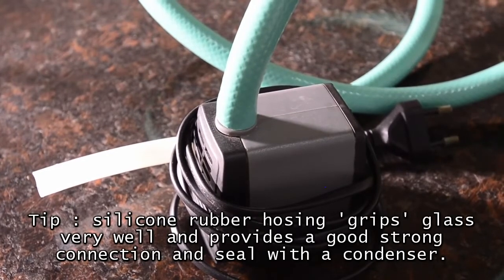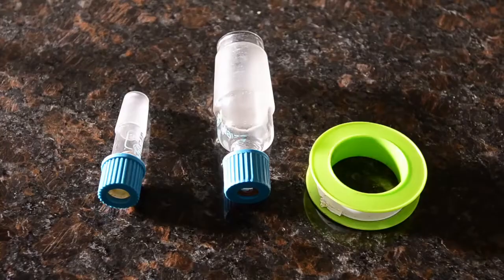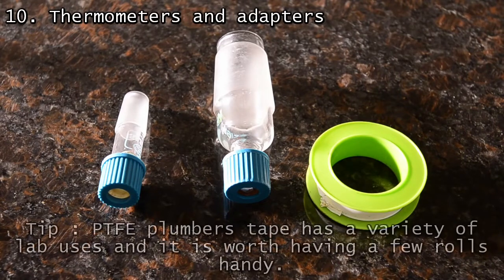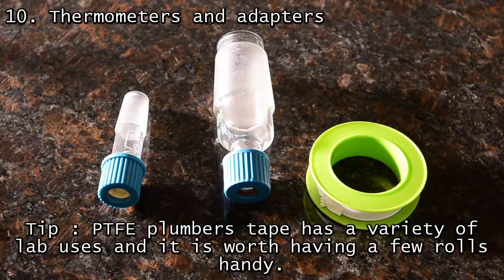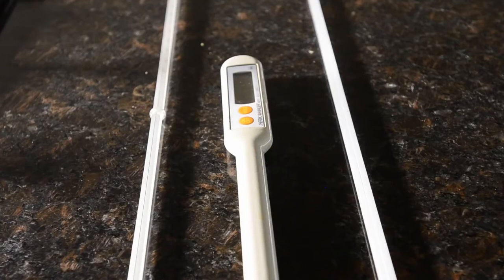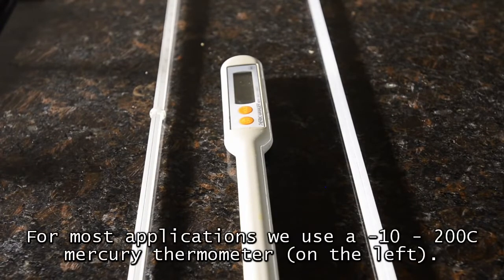Obviously, one end of one of the tubes needs to fit snugly over the water pump. To do distillation, you also need thermometer adapters so you can record the temperature of the vapors. Note that the rubber seals on these are useless and rapidly degrade. We find that PTFE plumber's tape is handy to help keep a tight fit. And obviously you'll need thermometers — we have two glass ones for distillation.